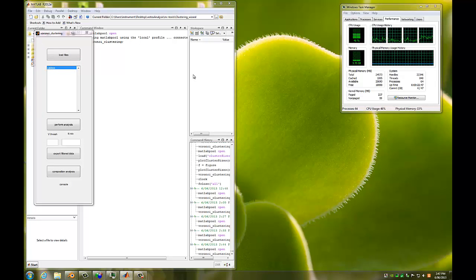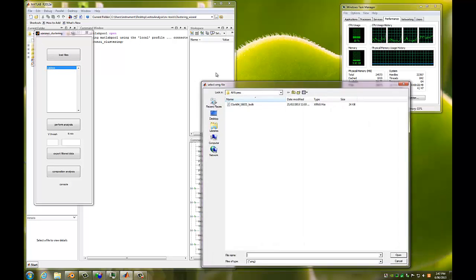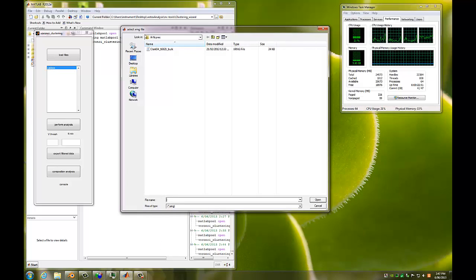The next thing you need is an Xrange file, which is the windowing file type that I'm using. It's something that I've developed myself. It's XML based, so if you program yourself, you might appreciate that because any programming language that you work with will have an XML parser, and you can simply load it in and you will be straight away able to use it.